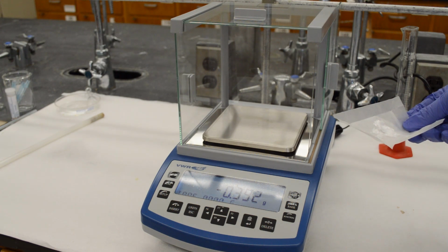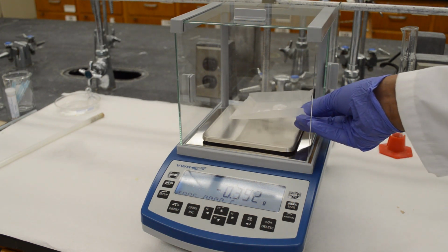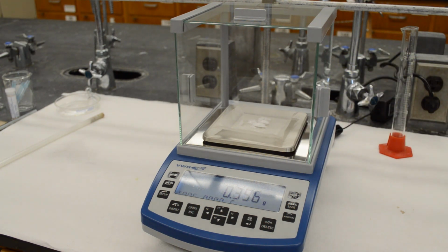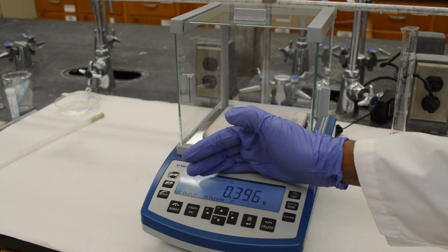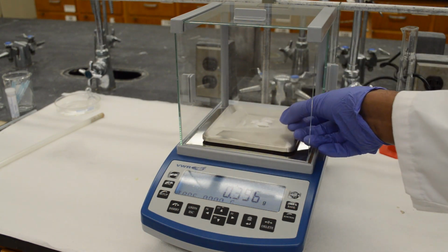Okay, this is the pure benzoic acid. Let's check the weight of this. That is the weight of pure benzoic acid, and here is the appearance.